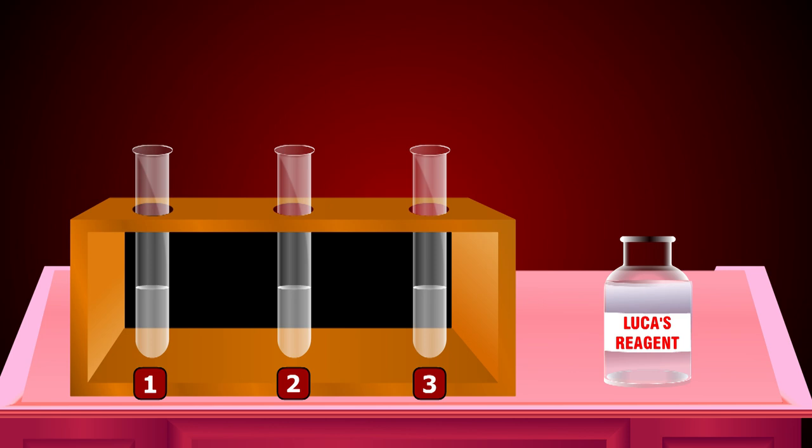Let us know about LUKAS test. Watch the experiment. Now you are adding LUKAS reagent which is a mixture of concentrated hydrochloric acid and anhydrous zinc chloride.